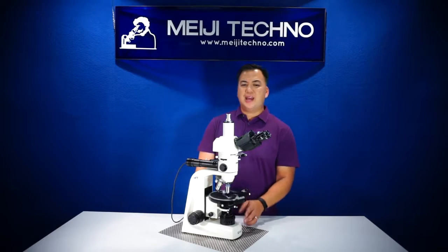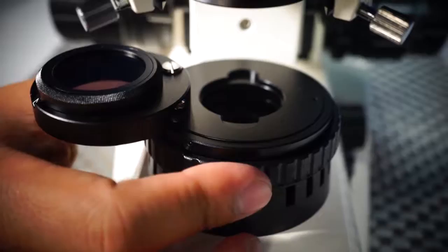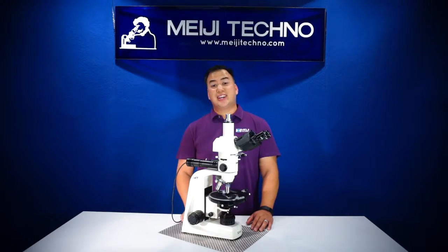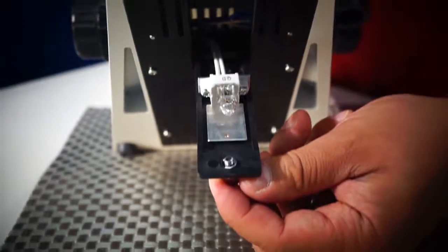At the bottom of the base, the MT9900 series comes with a rotatable polarizer in a swing-out mount. It can detent from 0 to 90 degrees. All MT9900 series models are available in LED or 6-volt 30-watt halogen models.